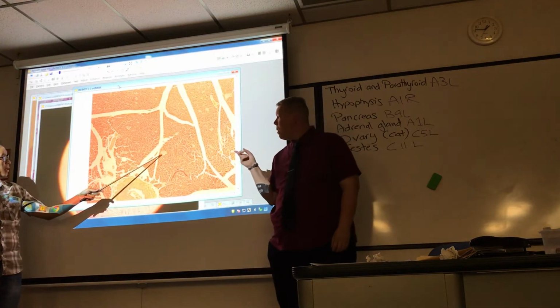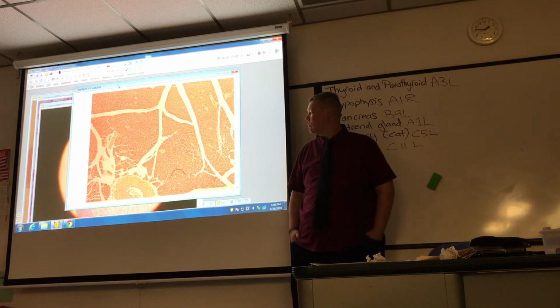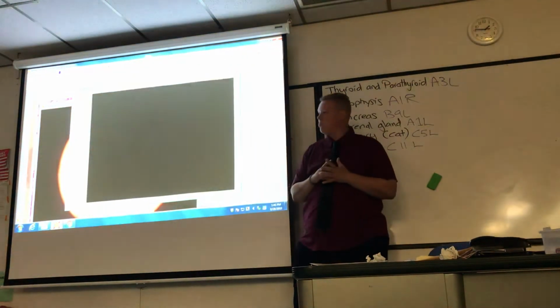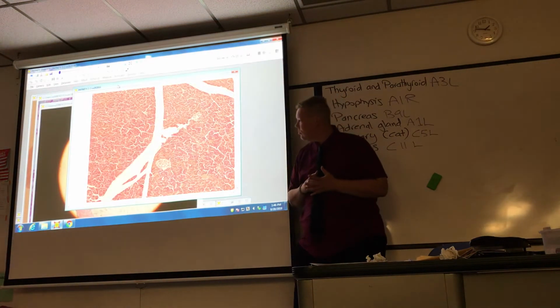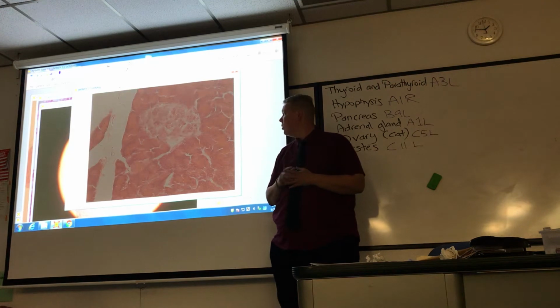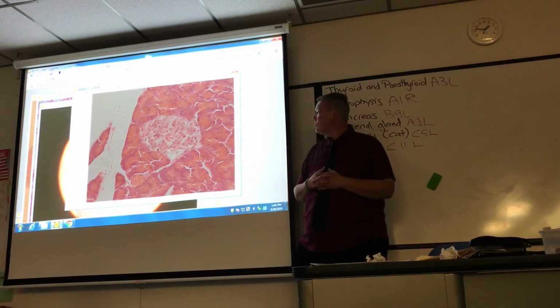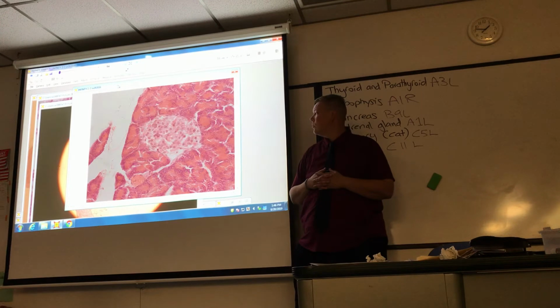This is pretty cool. Let's get that into a higher mag. This is 100, we'll go to 400. That's good enough.